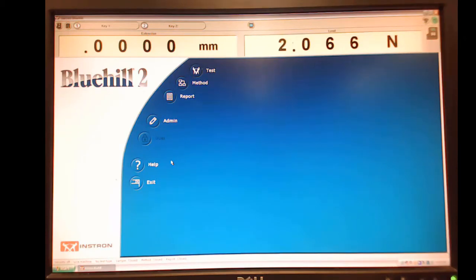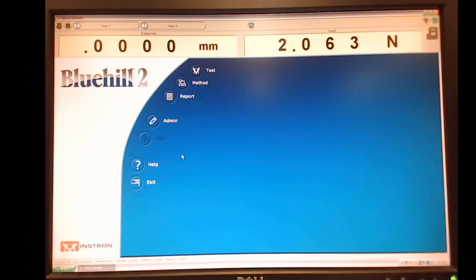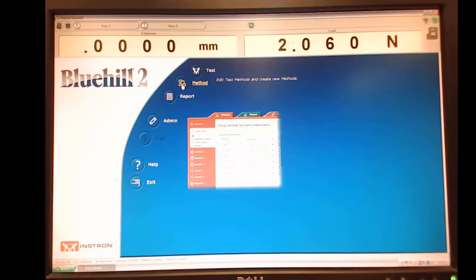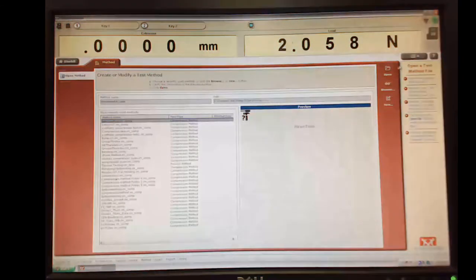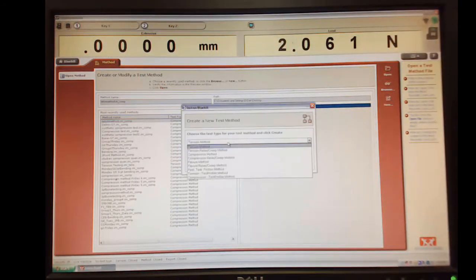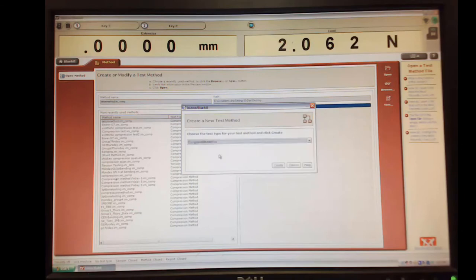And so the first thing we have to do, just like when we were testing tendons, is to set up our method. We're going to set up a method that is going to be basically compression, but it's going to be compression into three-point bending. So we're going to go to method and we're going to say new method, and we're going to want to do a compression method.